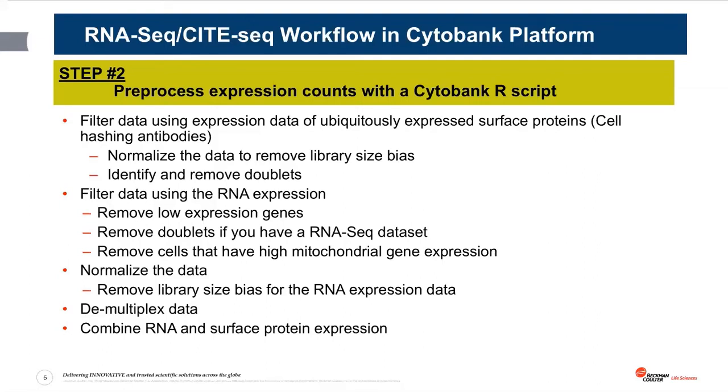And then at the end, very important, in order to analyze the data in Cytobank, you also need to combine the RNA-seq and surface protein expression data by using the cell barcode provided in the raw expression data matrix.